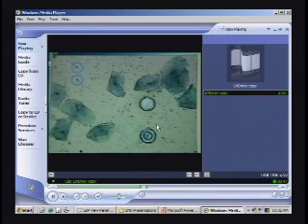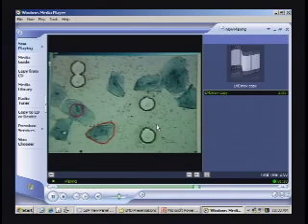At the time, I was timing how fast I could cut cells, and in about 20 minutes, I could cut about 100 cells if it wasn't a difficult sample, just an average sample. Kelly, I think, was timing some people the other day, and it was much faster. And then you can also collect epithelial cells, obviously in a different tube. You'll notice the color of the pen is different. And you can collect an entire cell body or just the nuclei, as demonstrated there.